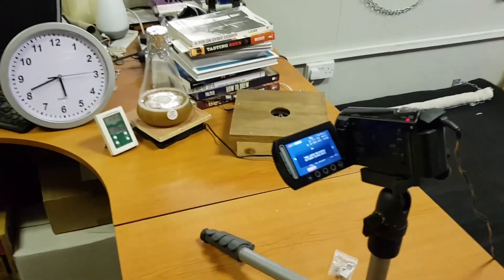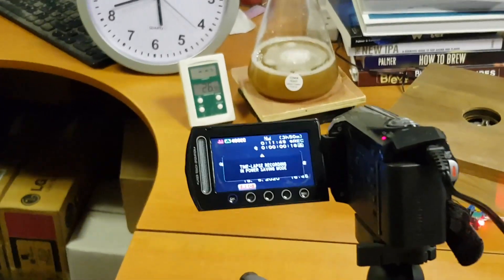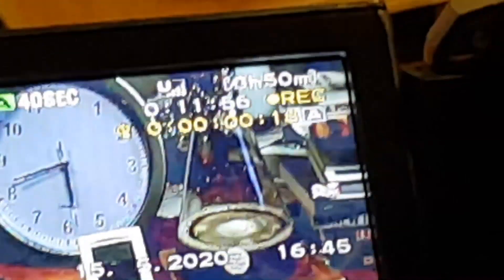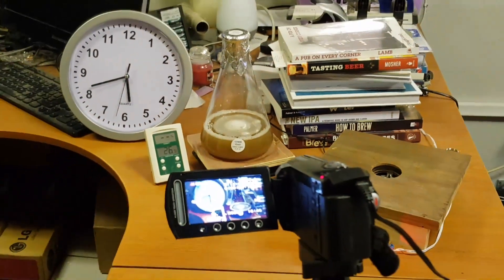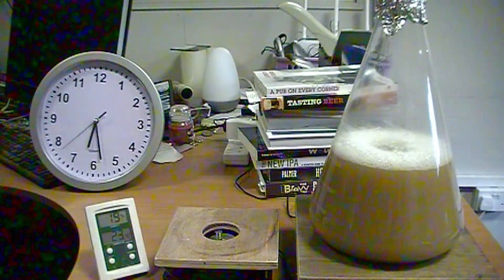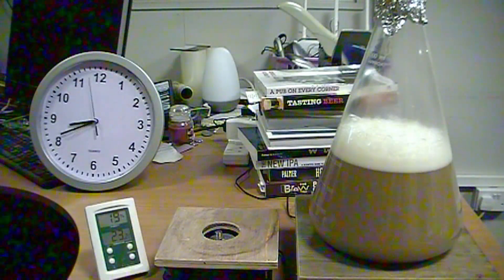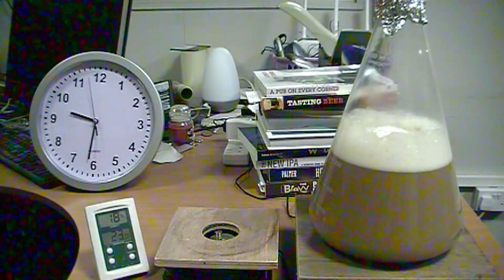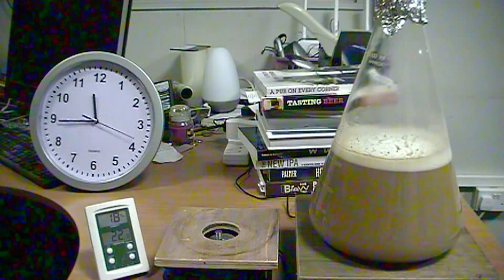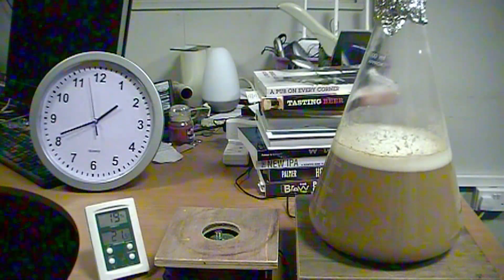I'm actually videoing this on a time-lapse — this is a small corner of my office that I generally don't use much these days. I'm setting this up now to take one image every 40 seconds. Now switching over to a time-lapse previously done — this is the WY1056 yeast, and you'll see how the yeast responds to the difference in temperature if you look at the little thermometer down there on the bottom left.